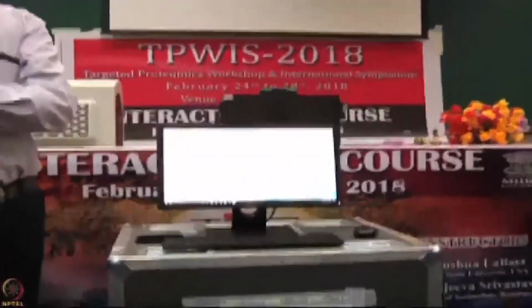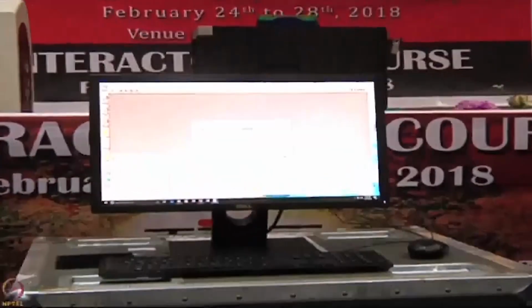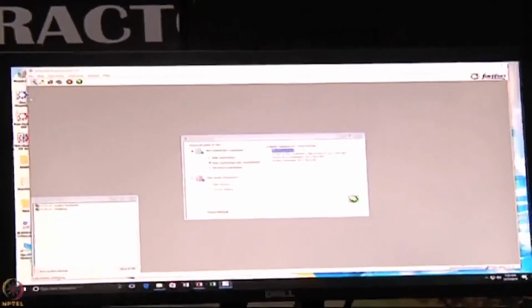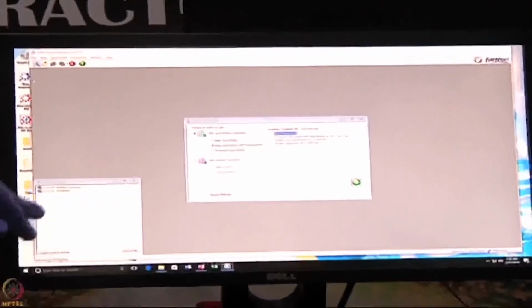In comparison to SPR, when you start the experiment, you have to pass the buffers, stabilize the flow and all that. Here, nothing is there. Just come in the morning, switch on the instrument, allow 40 minutes to stabilize. Just the lamp has to warm up. Now if you look, there is a status showing initialization.